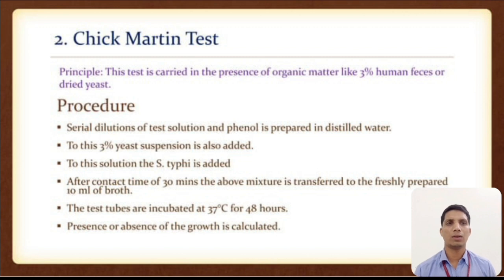In this series we have done the first test, which is the Riedel-Walker test. Now we come to the Chick-Martin test, which is used to determine the bactericidal efficacy of any disinfectant or substance.